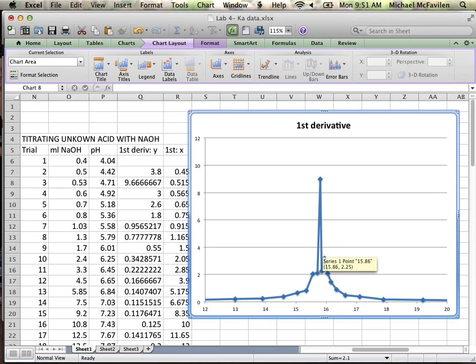Okay? So with this curve, what I would expect is this zoom in so I can see it a little bit cleaner, because the rest of it I don't care about because it's just going to be flat. You would give me this first derivative plot, you'd give me the axis labels, and you'd give me the figure caption describing what it is.